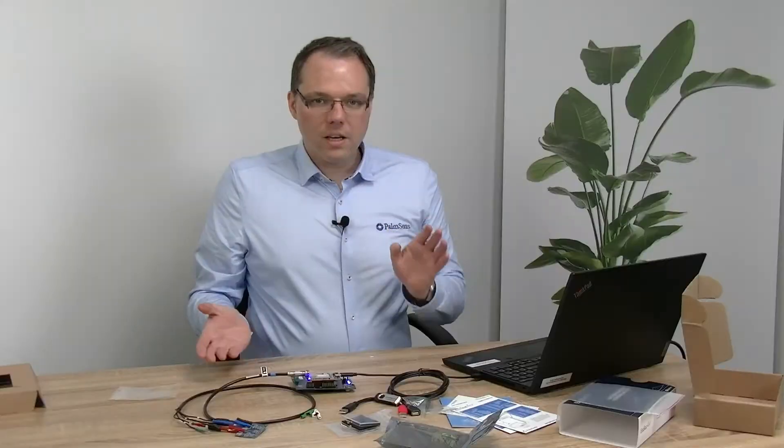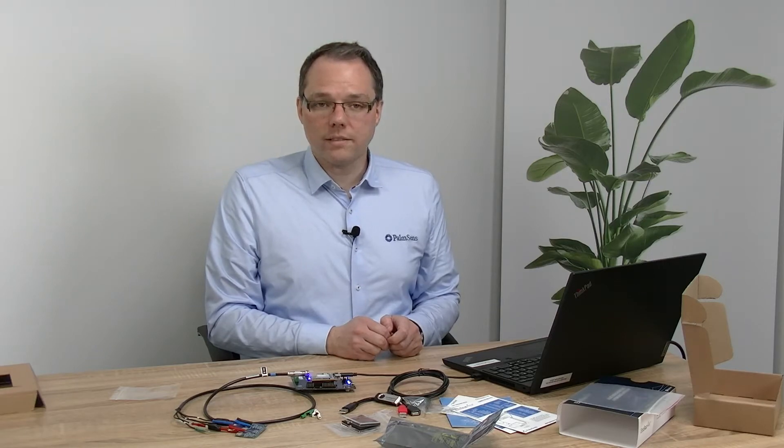So now we have our potentiostat connected and are actually already ready to do our first measurement. I have already installed and started on my computer the software PSTrace that you can use to control the potentiostat module. You can of course also start writing your own software immediately, but often it's easier for customers just to start first with our software to perform the first experiments and check if the potentiostat does exactly what you want it to do.